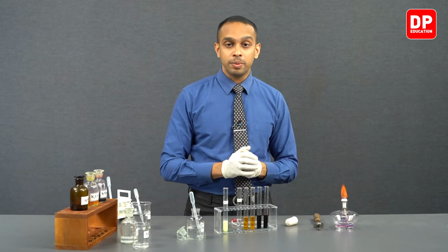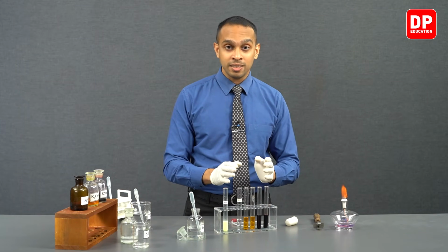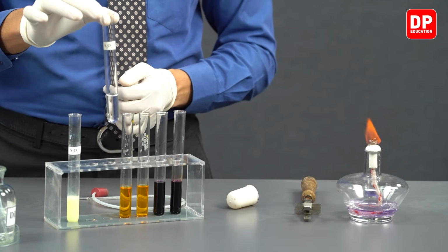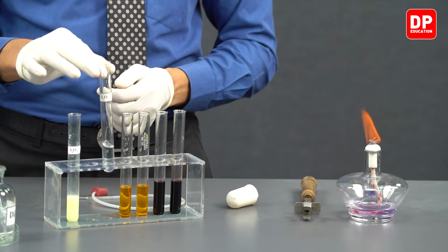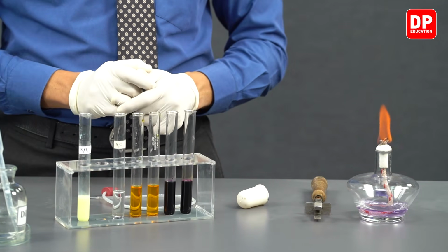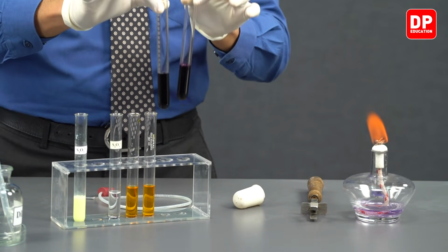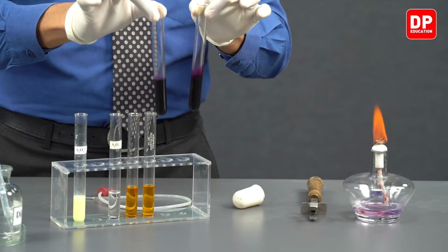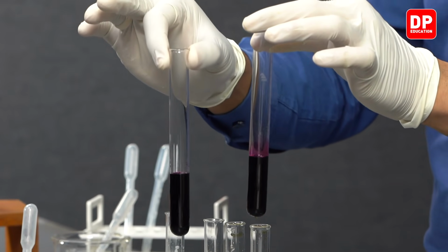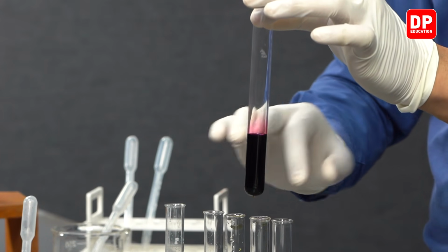We'll light up the spirit burner, and then we'll initially add a little bit of HCl into this thiosulfate solution and send the gas produced through our acidified potassium permanganate solution. Both of these test tubes contain acidified potassium permanganate solutions. One is going to be kept as a control, while the other is going to be used for this experiment.